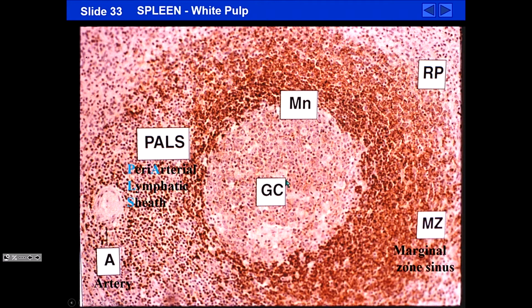And since we have a germinal center, that would suggest some sort of activation of B cells to form plasma cells producing antibody. Because they're plasma cells, they have more abundant cytoplasm. That's why this area in the center here is staining a lighter color, more cytoplasm of the plasma cells as opposed to not so much cytoplasm of the B cells. Questions?